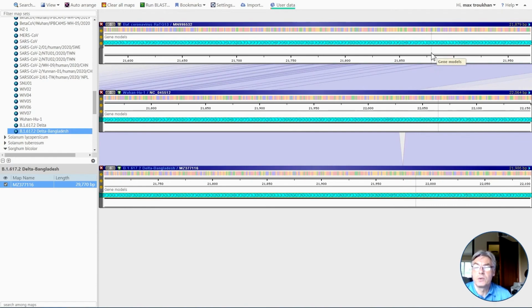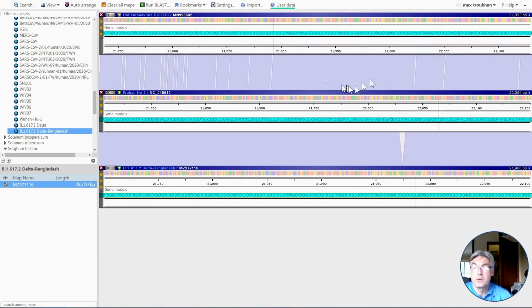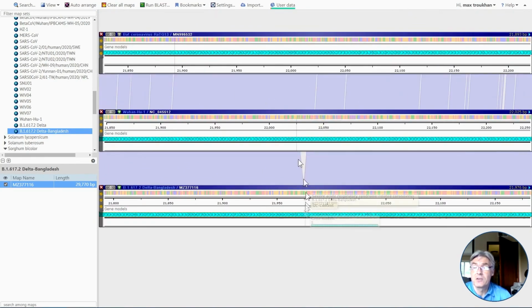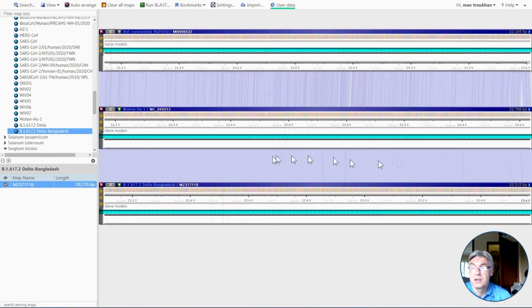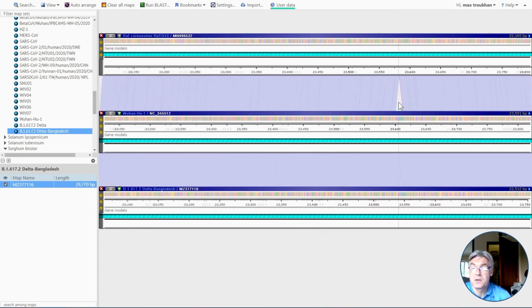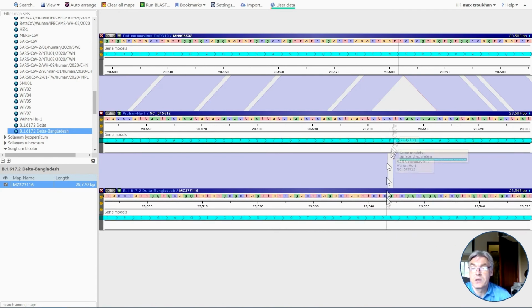And we also notice that when we compare the Wuhan version to the bat virus, there is also some mutation, insertion, deletion. It is somewhere here. Yes, here. This is the notorious furin site. You see this PRRARS VAS? This is the one. So when you compare the old one, it didn't have it.